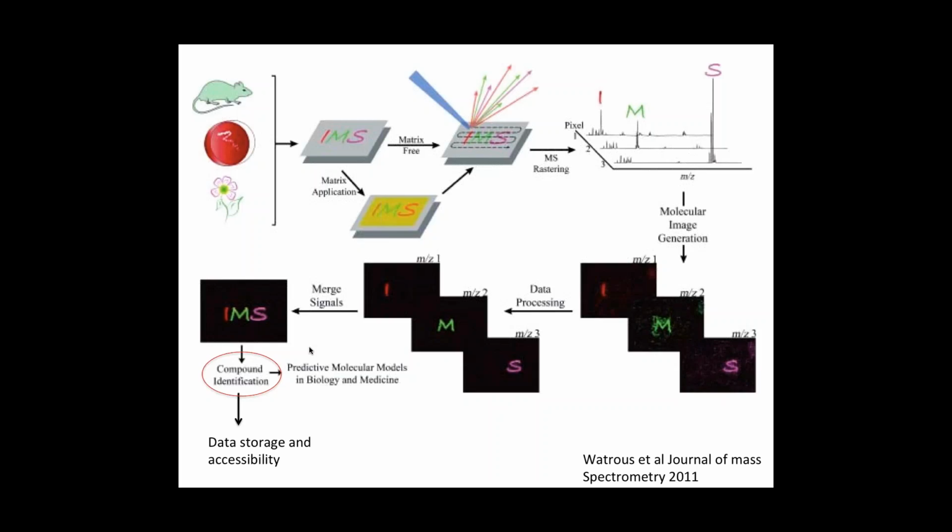Compound identification, I think this is truly the bottleneck in mass spectrometry. So let's say you're interested in a specific signal. You really need to take out the kitchen sink to try to figure out what that molecule is. And in some cases, this may be quick if you have reference spectra, let's say MSMS spectra in databases. But if it's not present in the databases, you need to isolate it and do the structural elucidation. That is often person years of effort that goes into that. And we discussed this a lot in the last Grand Challenge webinar that we had.